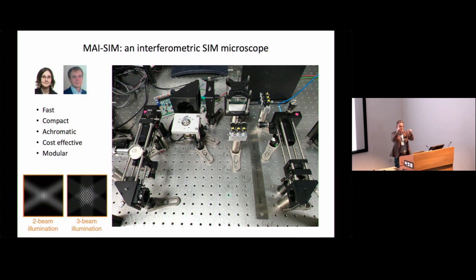So the beams are rotated by addressing different mirror pairs. And the other thing is that by sweeping across each individual mirror, we can actually also do the phase shifting very quickly. And the beauty of this is we have one moving element to achieve all this: pattern rotation for any color you like, and pattern shifting for any color you like.